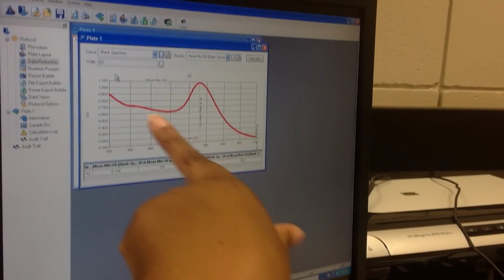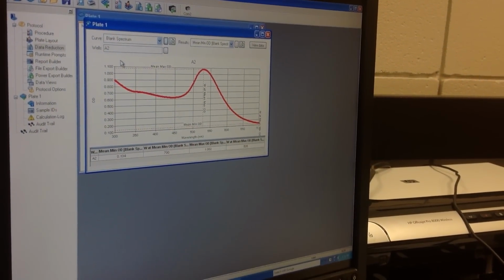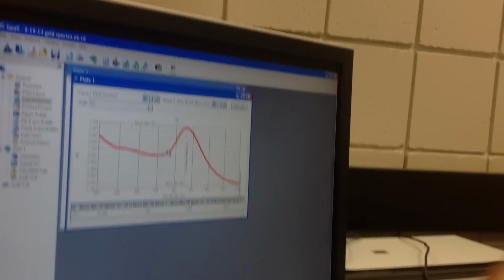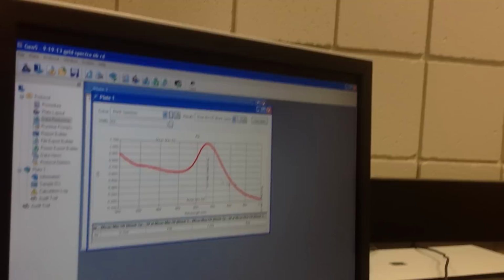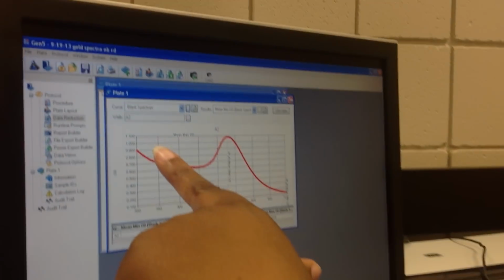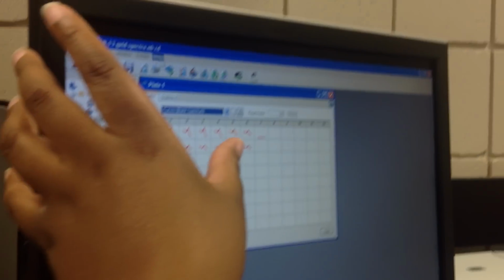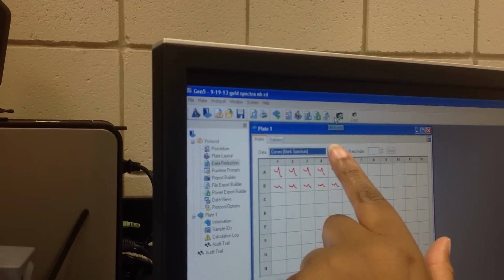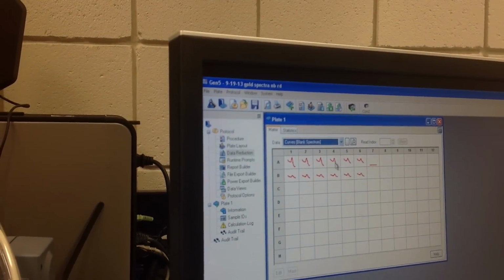Can you export to an Excel file and save to our flash drive? You have to do them individually. There is a bulk export. I have to remember how to do that. You can leave it like that. We can do it. There's a power export here. One of these exports all of them at one time.